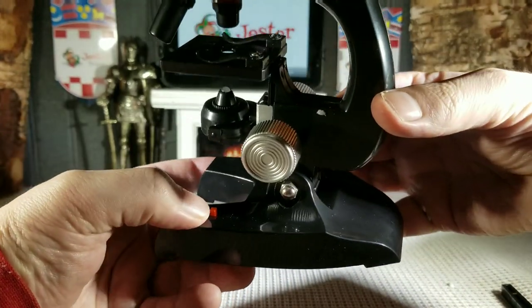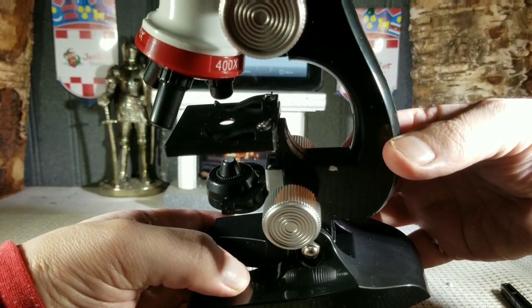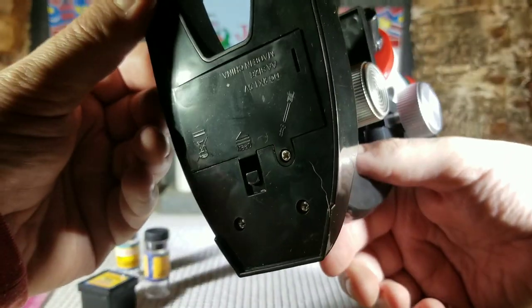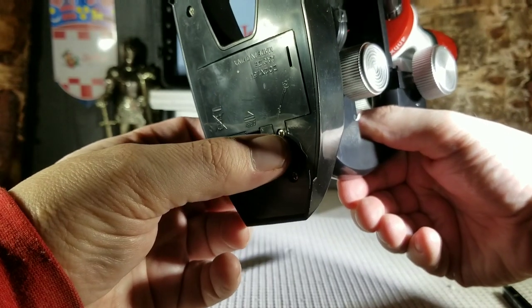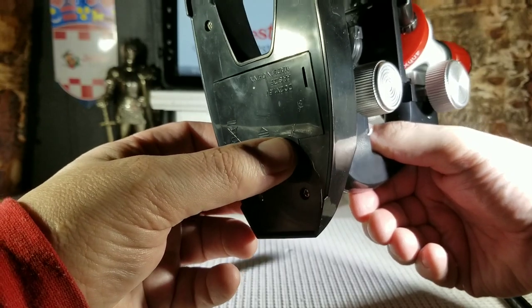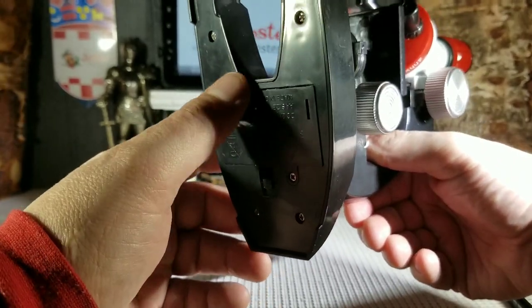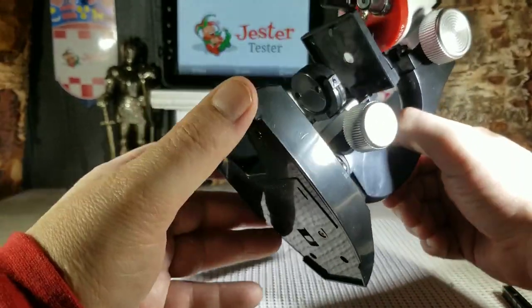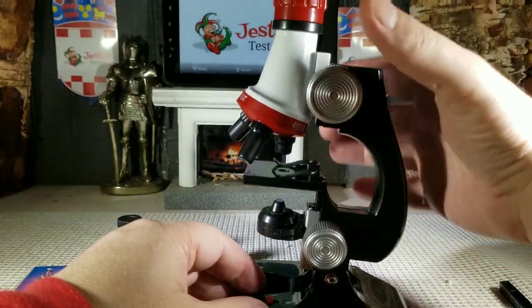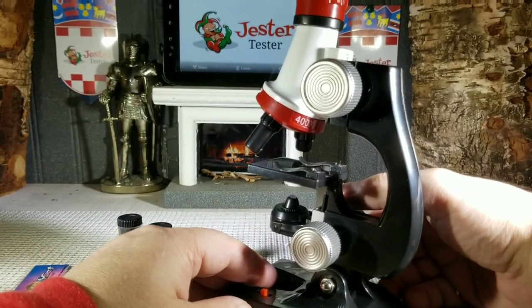Your light control is right here — you can turn that on and off. It runs on two AA batteries at the bottom; you just unscrew it and the batteries go in. Very simple. It does work really, really nice — you can see from the specimens we put on that it magnifies very nicely.